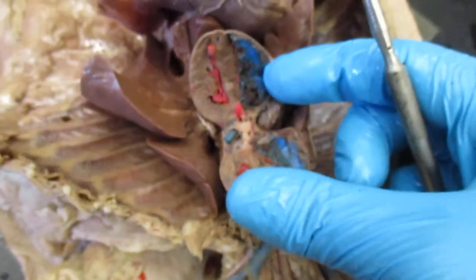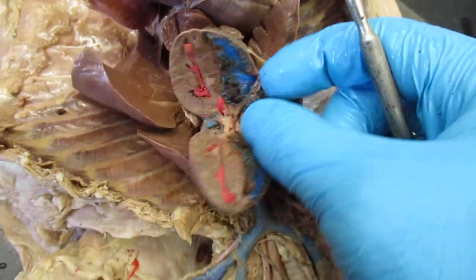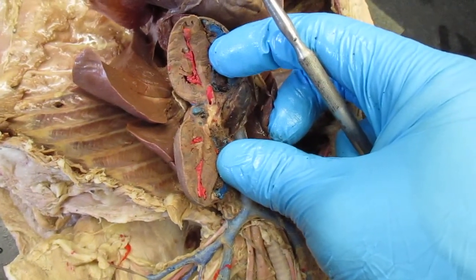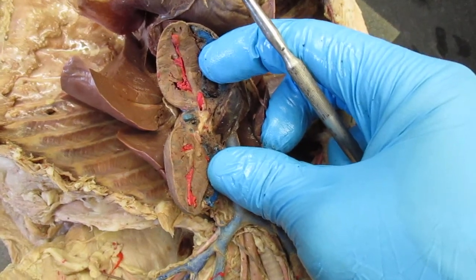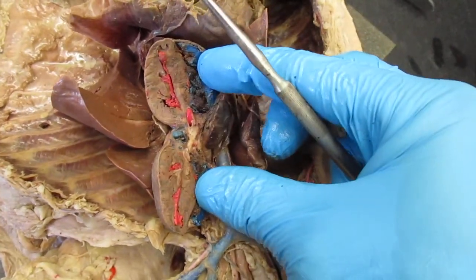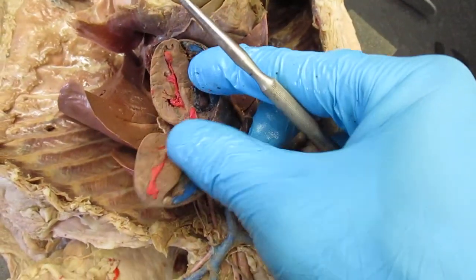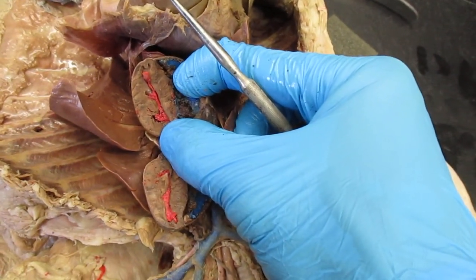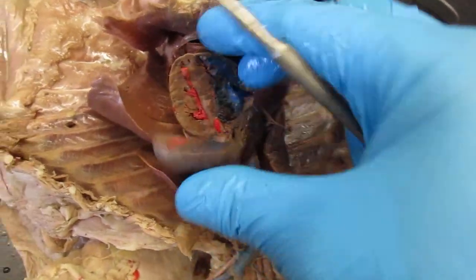Okay, right here, I opened up the heart, and you can see on the right side is deoxygenated blood, or CO2 blood, denoted by the blue latex. On the left side, oxygenated blood, which is represented by the red latex or pink latex.